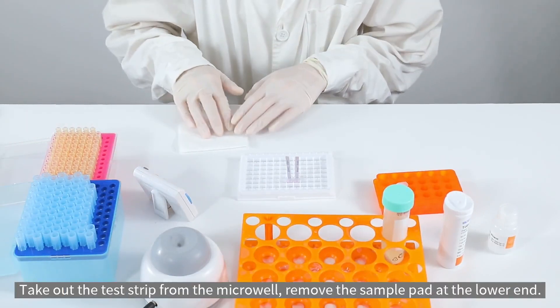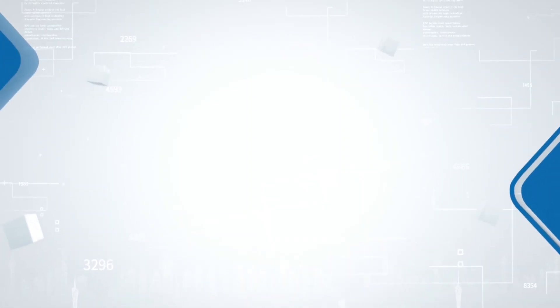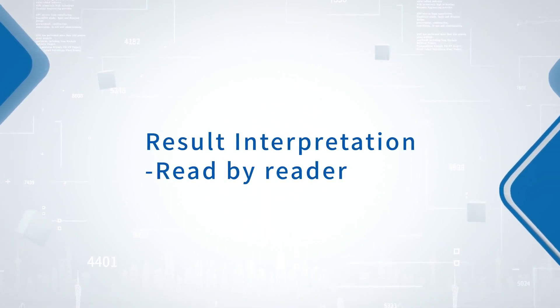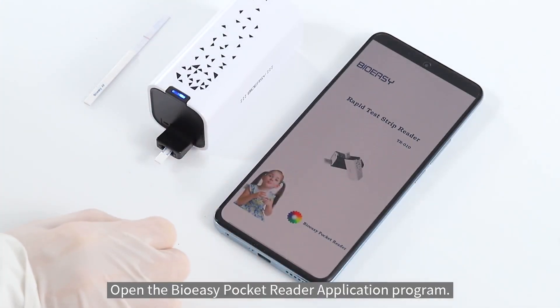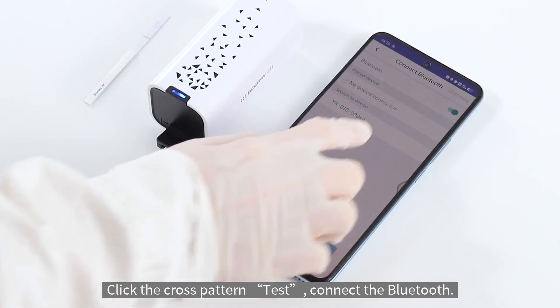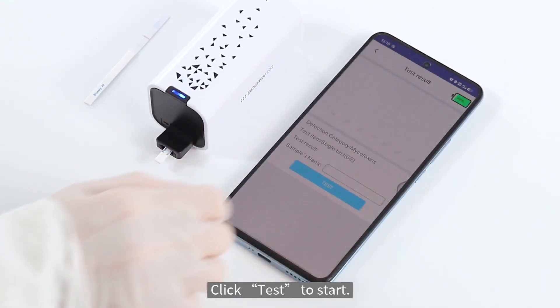Take out the test strip from the micro well and remove the sample pad at the lower end. For result interpretation read by reader: place the test strip into the strip slot completely and push the strip slot to the bottom. Open the Bio Easy Pocket Reader application, click the cross pattern test, connect via Bluetooth, select mycotoxins and the test item, then click test to start.